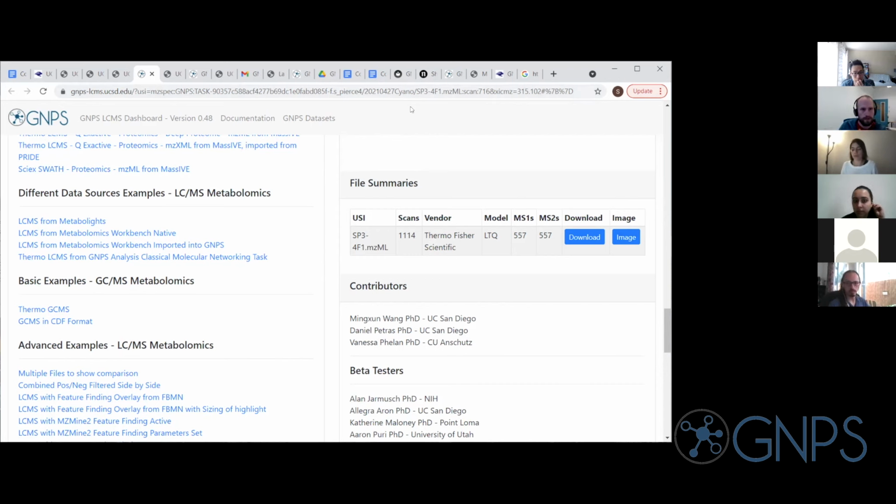So if you have an isobar that elutes a couple of minutes later, you know, you want to clear it up periodically. So in case another molecule with the same mass elutes later, that this gets considered again for MSMS.